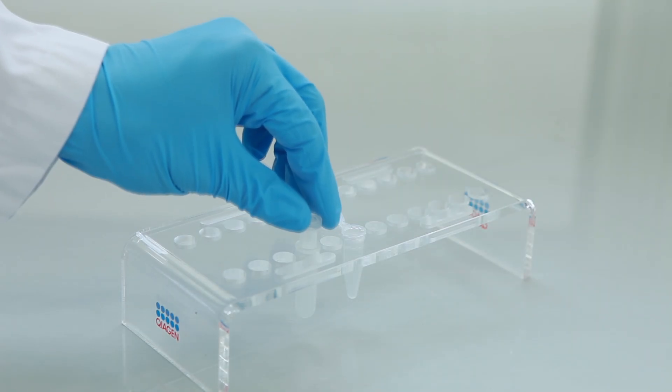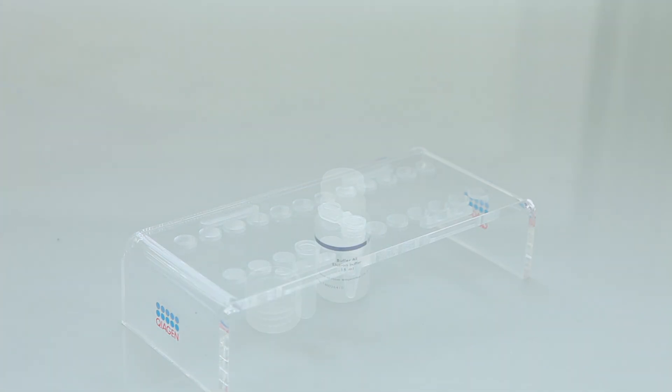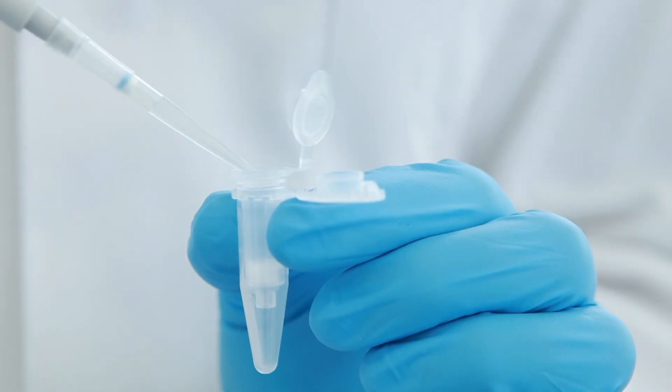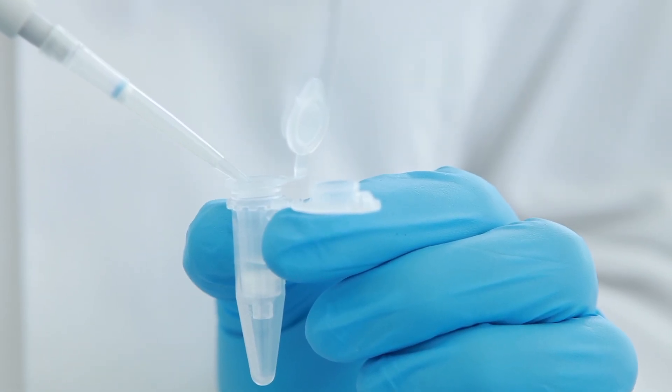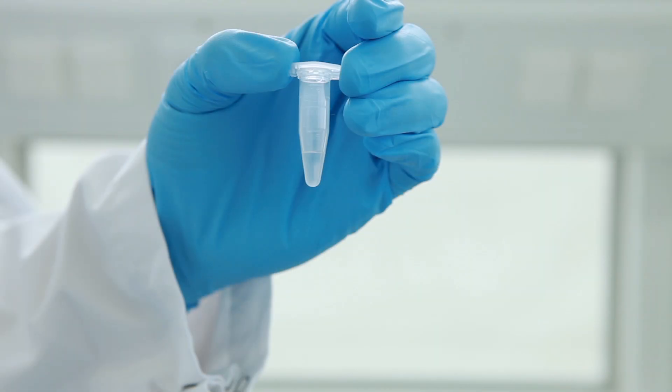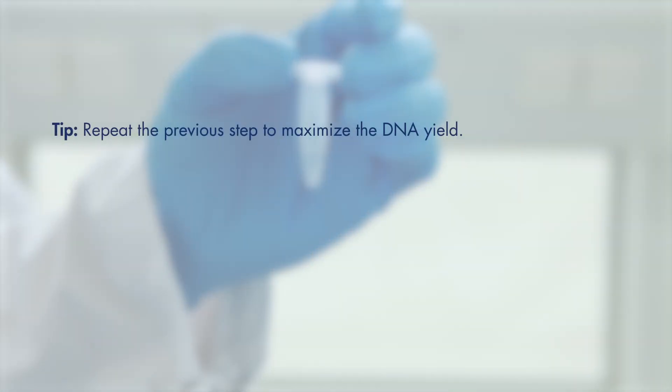Place the spin column into a new microcentrifuge tube. Add 200 microliters of buffer AE. Incubate for one minute at room temperature. Centrifuge for one minute to elute the DNA. For a higher DNA yield, repeating the last step increases the elution efficiency for small volumes.